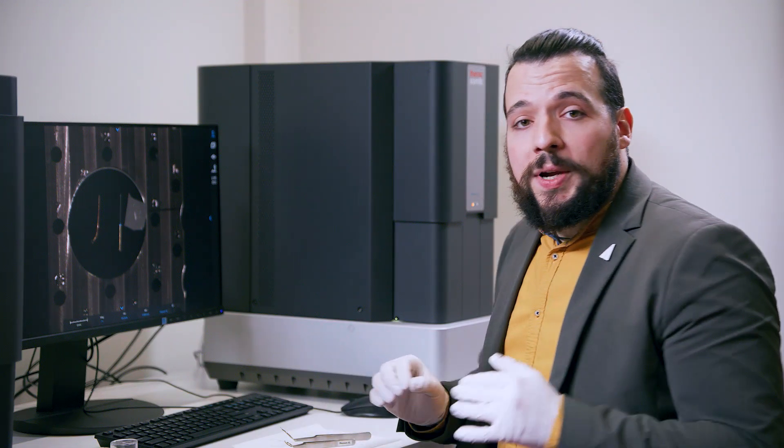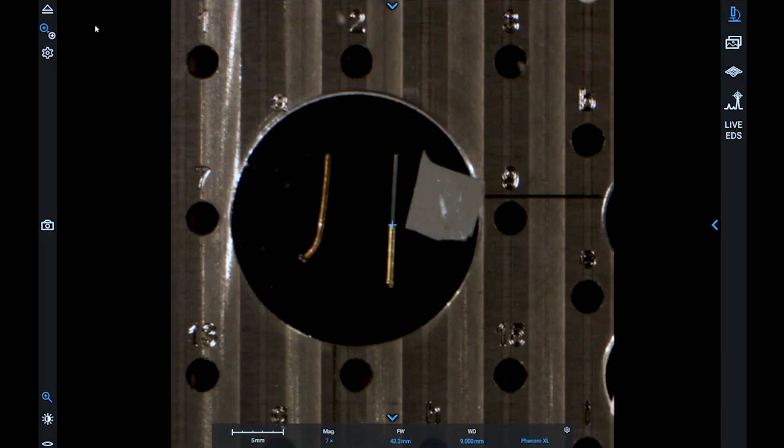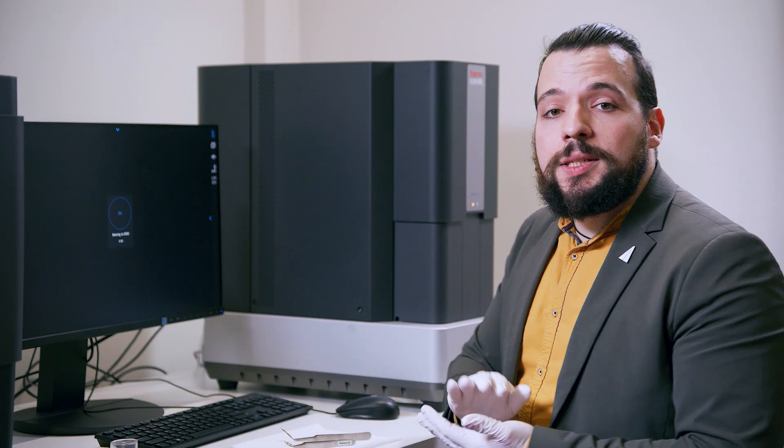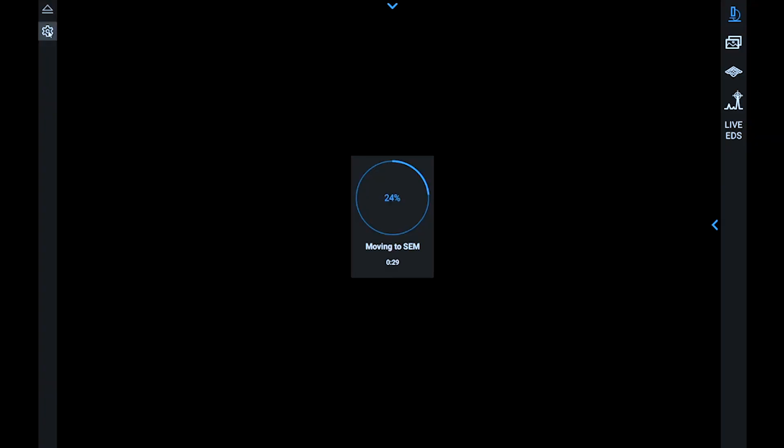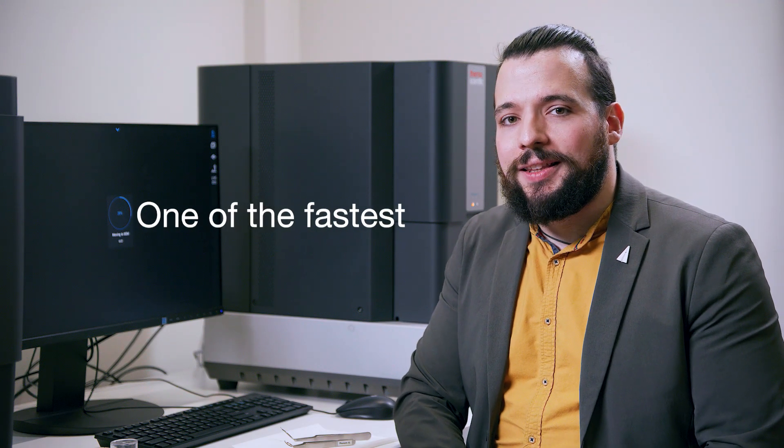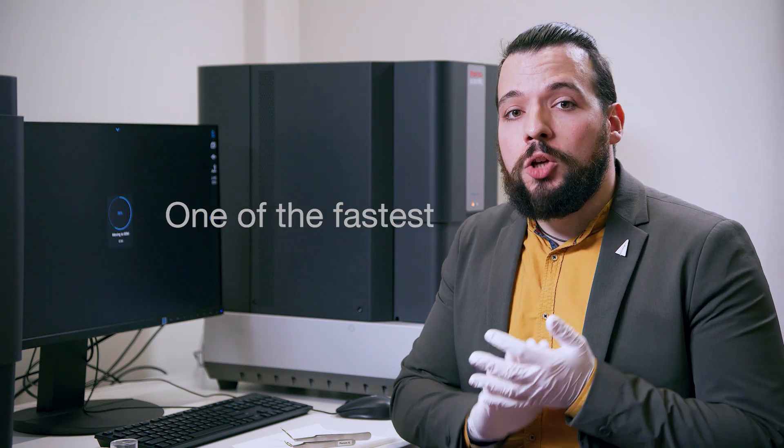When we are satisfied with the position where we want to image, we can click on the load sample to move to the SEM area. By clicking on this button, we start the pump down procedure. The Phenom XL is one of the fastest electron microscopes in the market, and it only takes 40 seconds to create the vacuum that we need to start imaging.